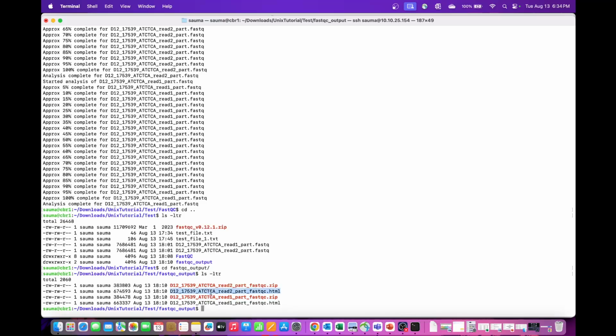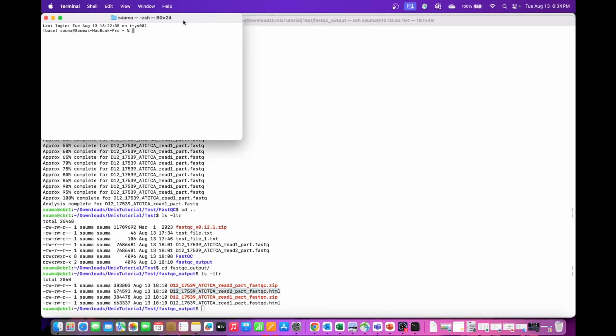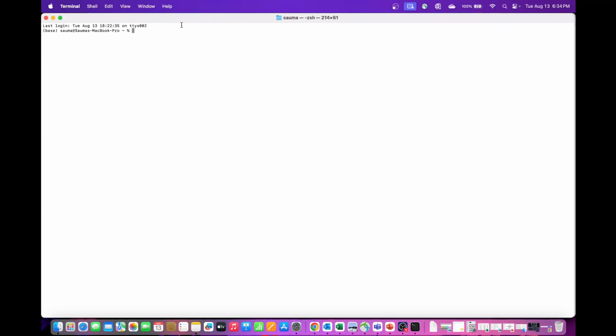So let's open this HTML file. First, let me download it. This is not in my system. If you remember, this is in my connected system. So I need to bring it to my system to see it. So let me do that.